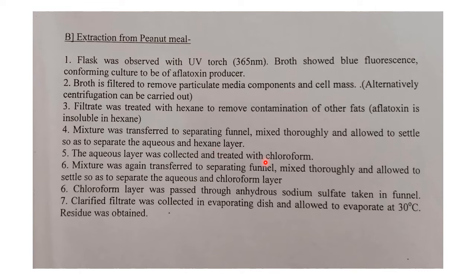Okay, as it is a broth meal, or we can say liquid state fermentation, there are some small components present from the peanut meal or from your media, and they can interfere, so we need to treat our filtrate with hexane. Okay, so this is the difference between the solid state and liquid state fermentation extraction procedures.